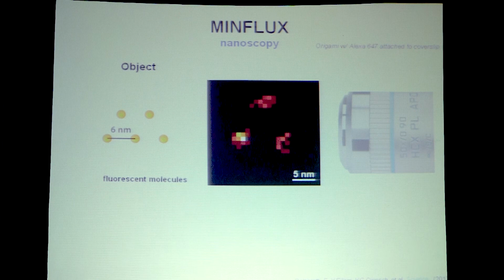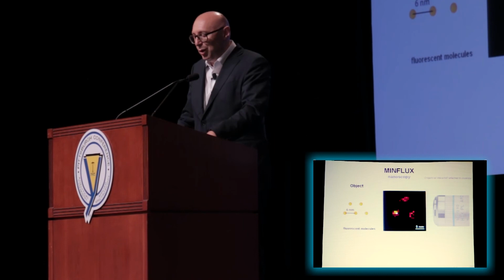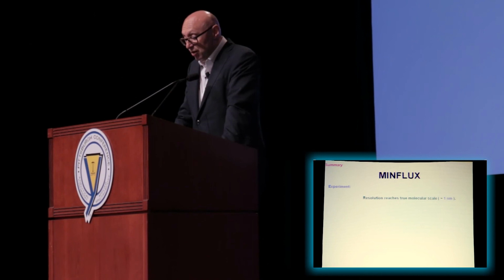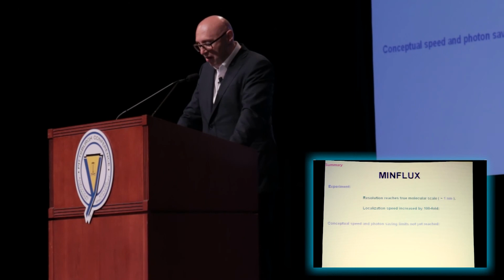And the key to this achievement is not to resolve by the phenomenon of focusing, but to resolve by molecular states. Now, to sum up, resolution at a true molecular scale can indeed be achieved. These were the first experiments showing that this is possible in a very general way. The localization speed can be increased 10-fold, 100-fold, and this is just the beginning. I think it will also be 1,000-fold and even more in the future, because the conceptual speed and photon-saving limits have not been reached.